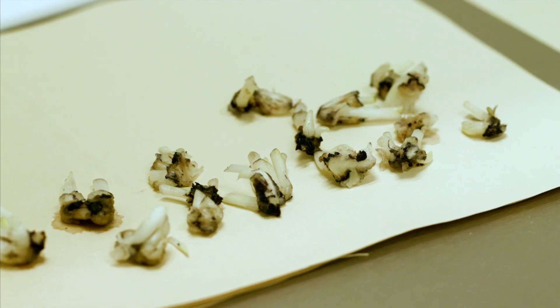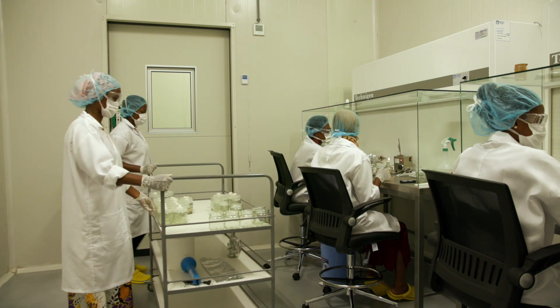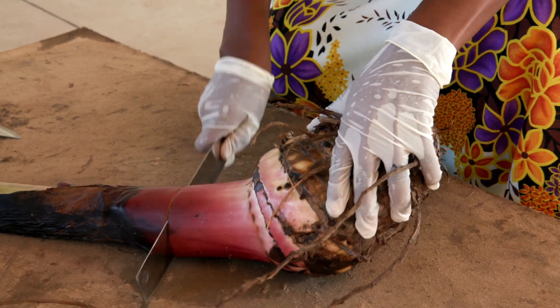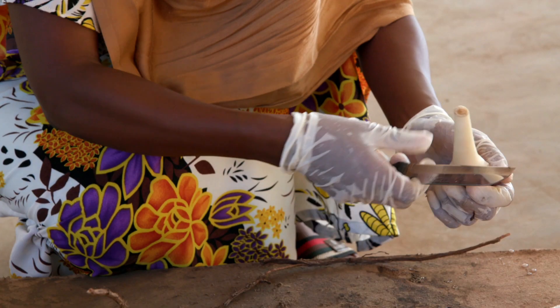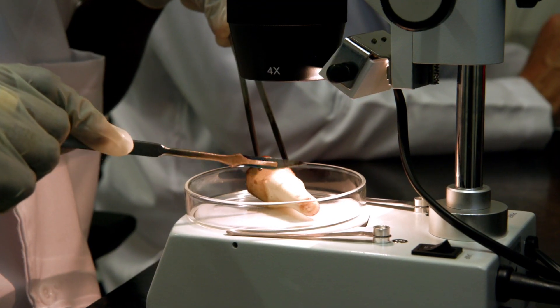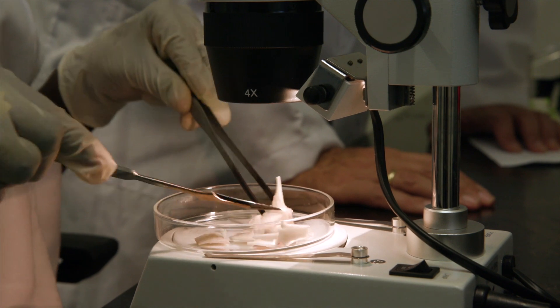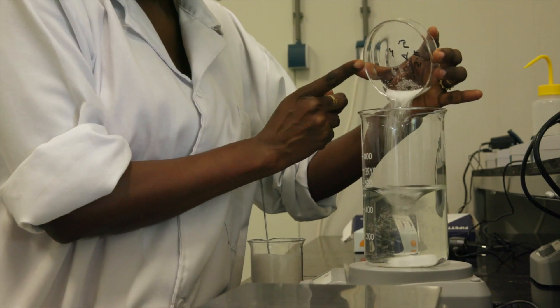We use tissue culture to make the best seedlings possible, and this is how we do it. From a healthy banana plant we take out cells known as meristem. This is the part where all plant growth starts. In our laboratory, this plant tissue grows on an artificial media which is prepared in our media kitchen.